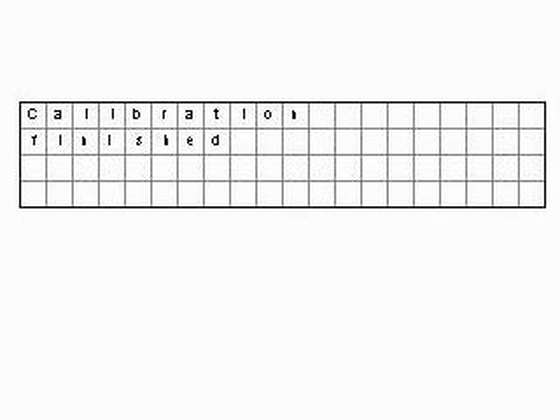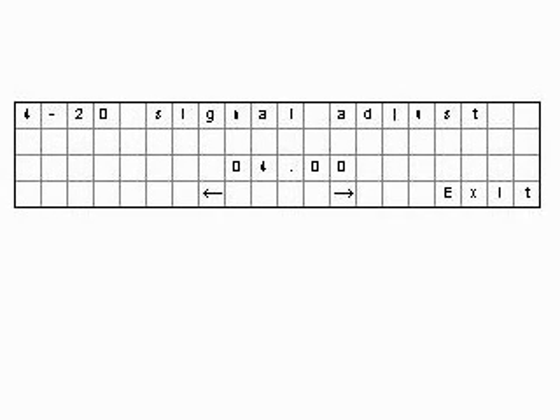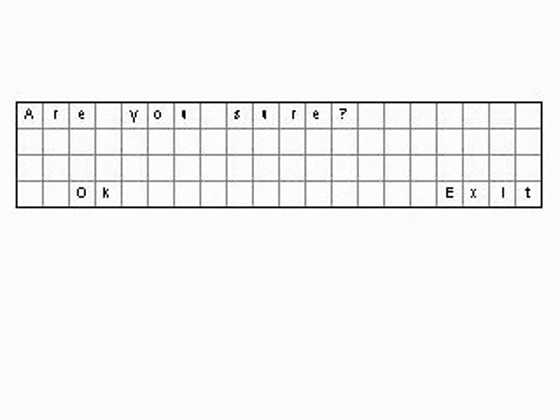It may also happen that the calibration process fails due to a very high or low calculated slope. If this happens, the data acquired to calculate the new line will be ignored and we will see this screen. Finally, we have to show the screen that we will see if we choose the testing option, and the screen we will see if we choose to apply the factory settings. If we choose OK, we will see this message for a while.